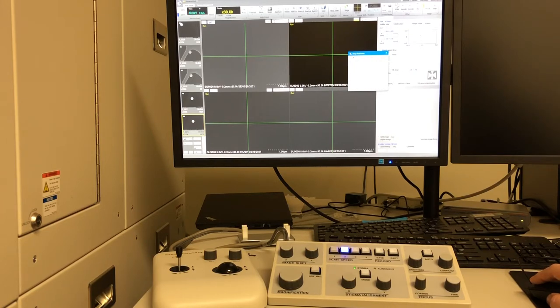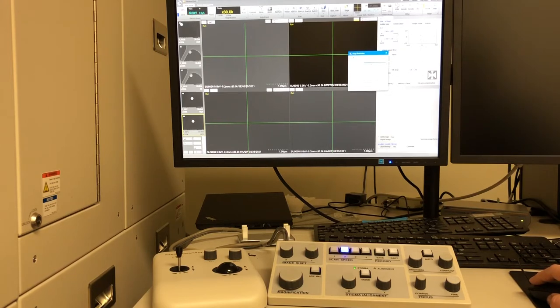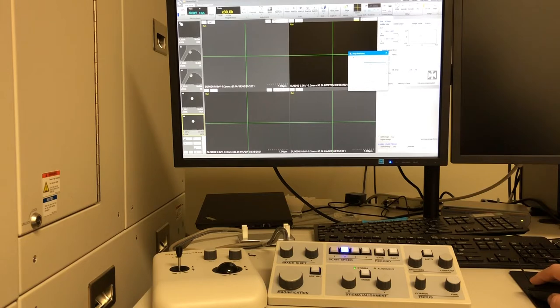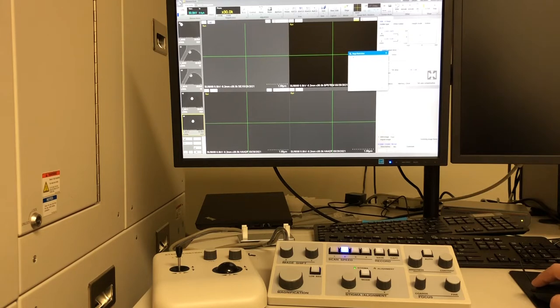For most experiments here at Georgia Electron Microscopy, you'll either be doing the stem holder or the standard holder. In this case, we're using the stem holder. So I've now selected it and I will press close.